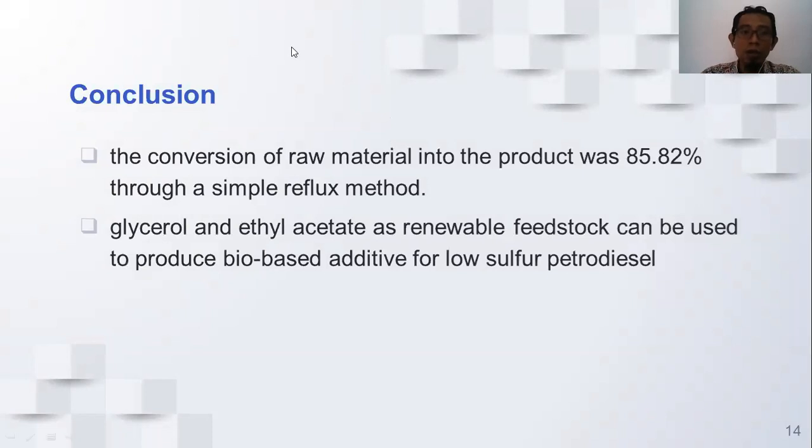Finally, the conclusion of this presentation. The first, the conversion of raw material into the product was 85.82% through a simple reflux method.